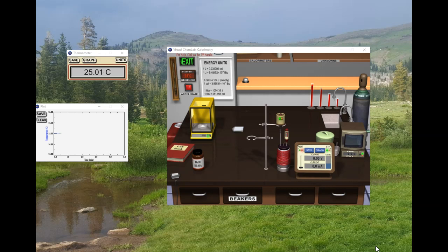for the heat for the third one and see if they match up. So this is verifying Hess's law. And we're looking at exothermic reactions here so that you can verify that Hess's law works. And knowing 2 equations, you can figure out a third one that you don't have to do in the lab. We're going to verify and do the third reaction in the lab so you can see that Hess's law works. But in reality, you can use any reactions that you already know and solve for a third one.